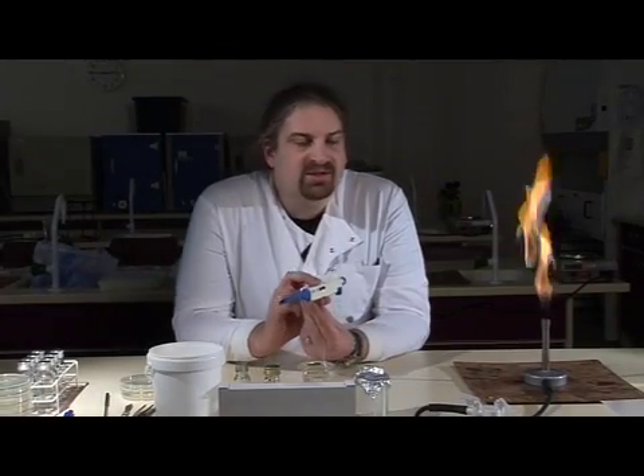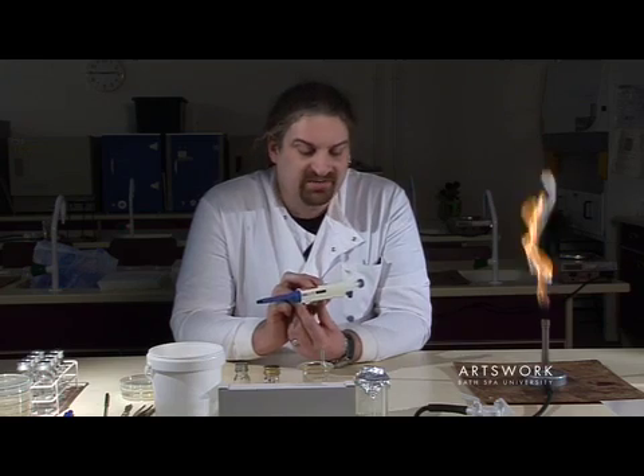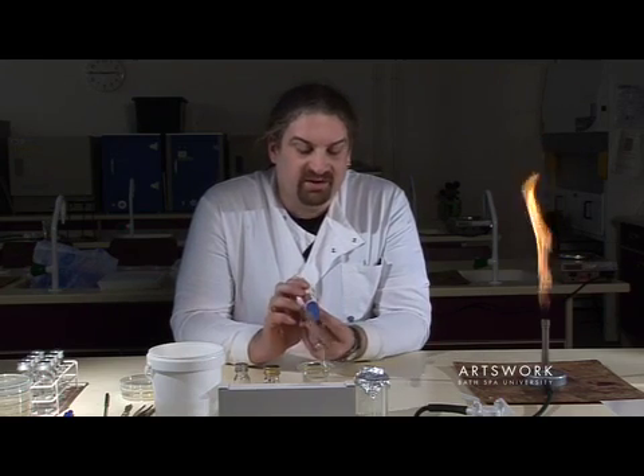What we're going to look at today is how to safely and accurately use one of these pipettes. We use these regularly for transferring samples in microbiology.